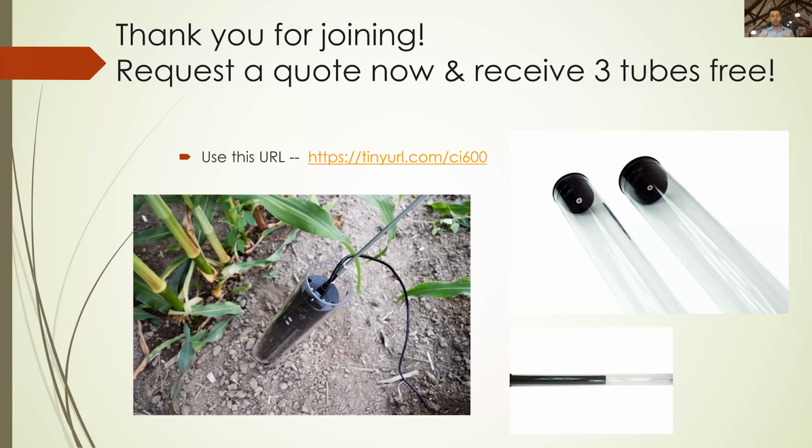Now, these tubes, since they are acrylic, are fairly resilient, but the next question is dealing with them deforming below ground. And the answer is anything. There's very little in the way of a clear tube that can't deform below ground at this point if you're giving it the right conditions. So if you're flooding the ground, or if there's a lot of pressure. But the biggest thing I find is the initial installation, that really dictates how well that tube is going to perform as you're using the scanner on it. Usually after being installed and after it's settled and the roots have grown around it, those tubes are pretty much good to go for the long haul, for actually many years of study.